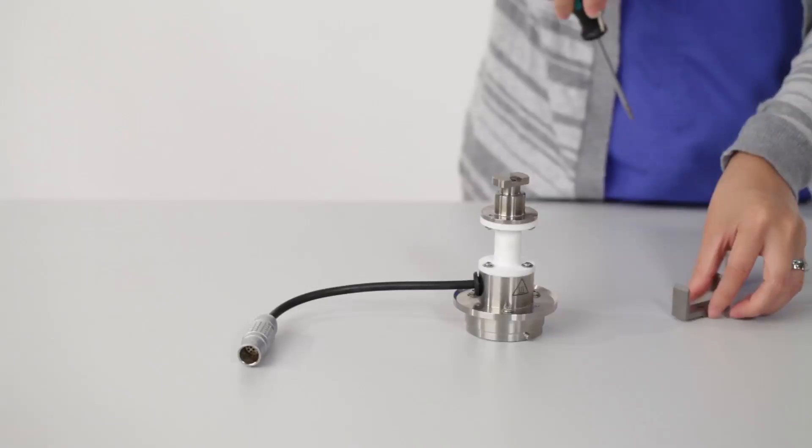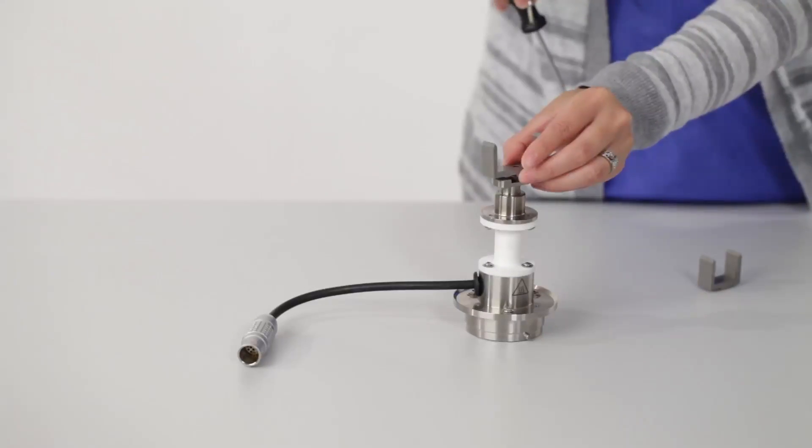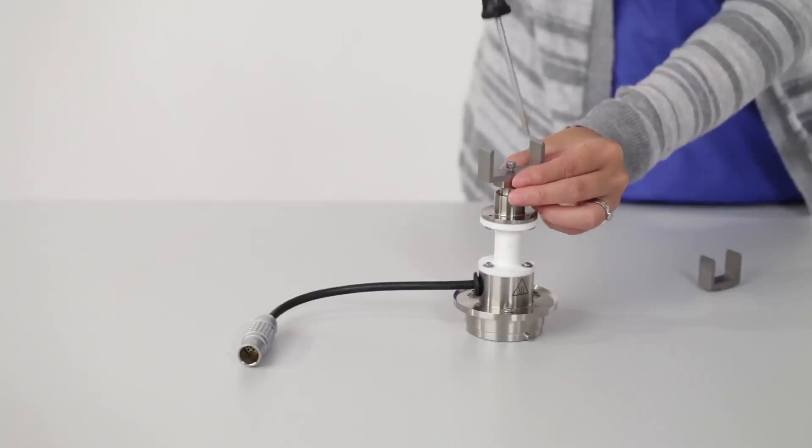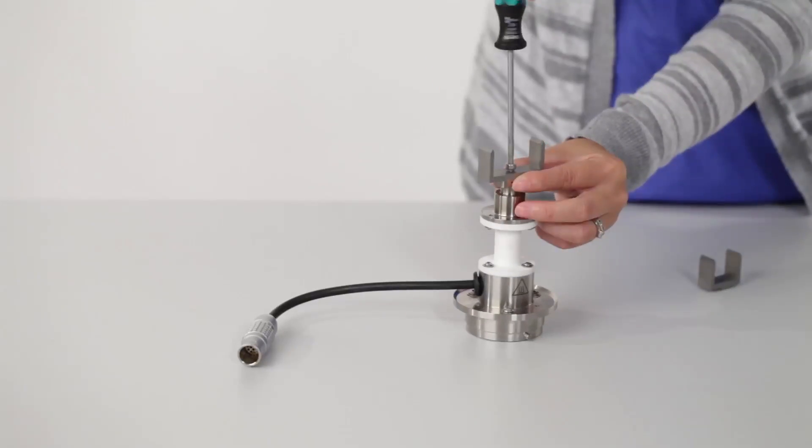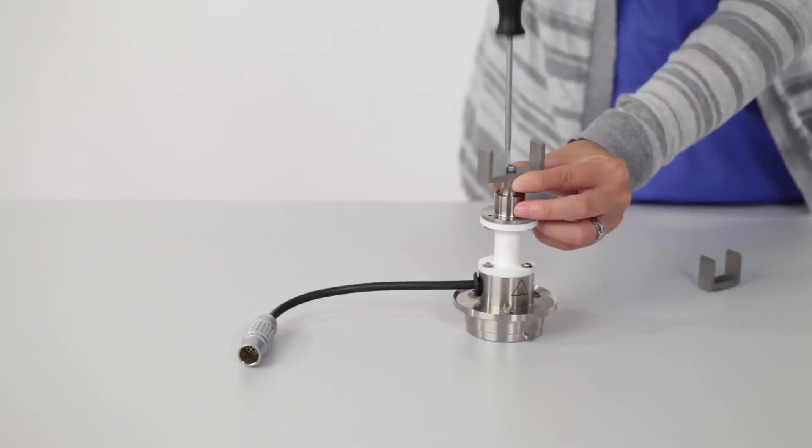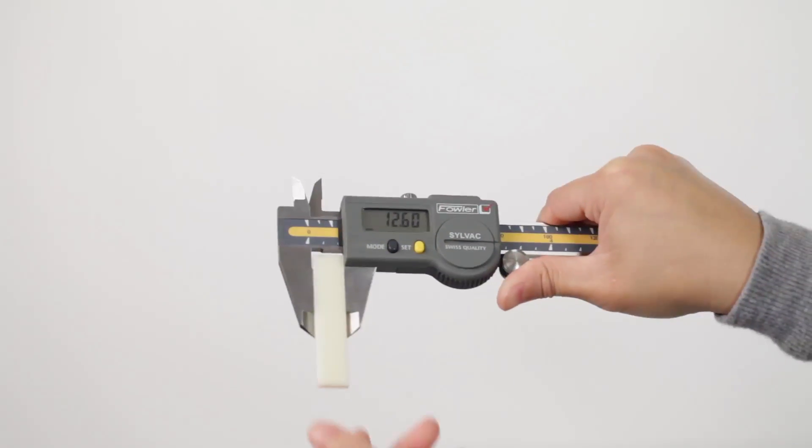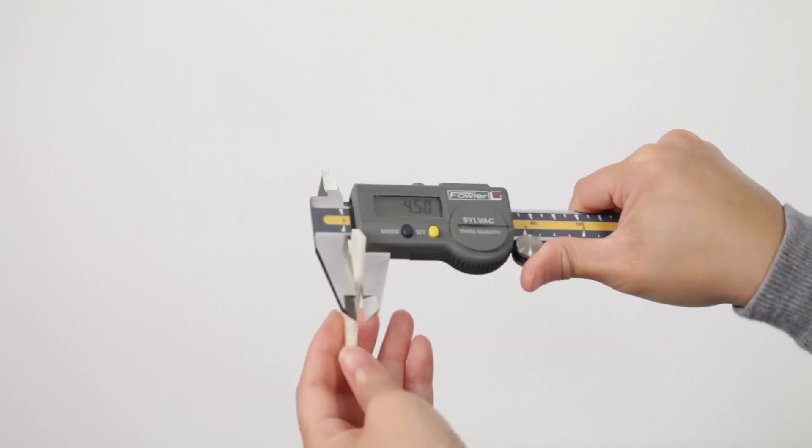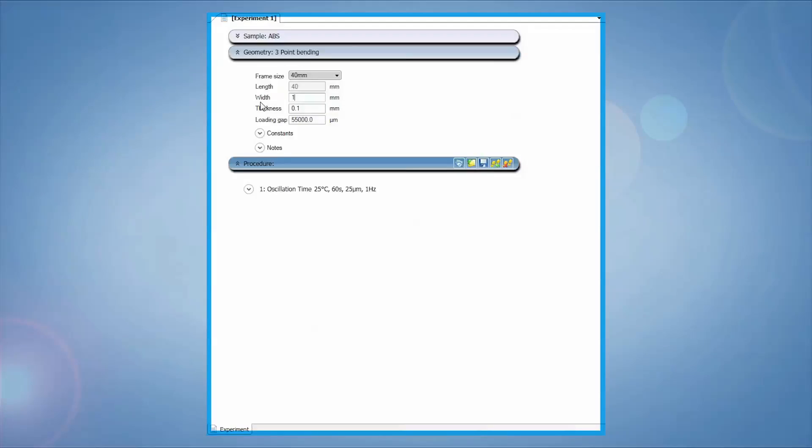Use the screwdriver to remove the 25 millimeter frame and install a different size frame if desired. Use the calipers to measure and enter the sample width and thickness under the geometry file. Choose the correct frame size from the drop-down menu.